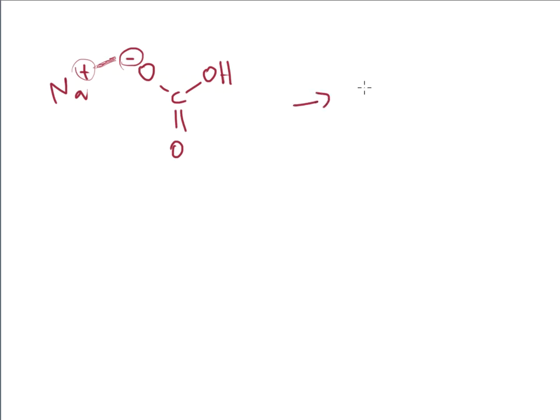This molecule, NaHCO3, is otherwise known as baking soda. All right, folks, that's what it is. It's baking soda. So you probably have sodium bicarbonate in your pantry, in your kitchen at home. You probably have used sodium bicarbonate in your cooking if you're making cookies or cakes or some kind of muffin, and that's all that it is.